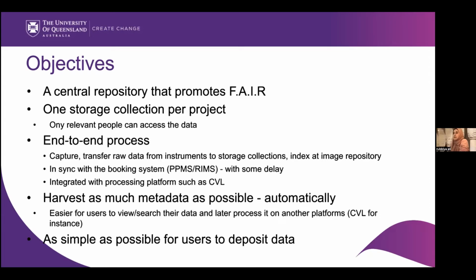What does that mean is, a user comes in, he captures his data using the microscope, we transfer raw data from the instrument to the storage collection, and after dropping all the data into the storage collection, each file should be automatically indexed in the image repository so that it is searchable at some later point. Now, we needed to have some base information about instruments and projects.